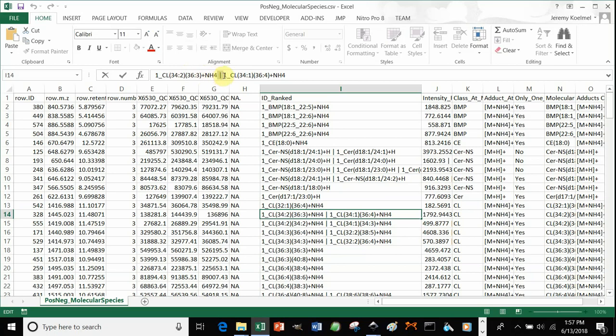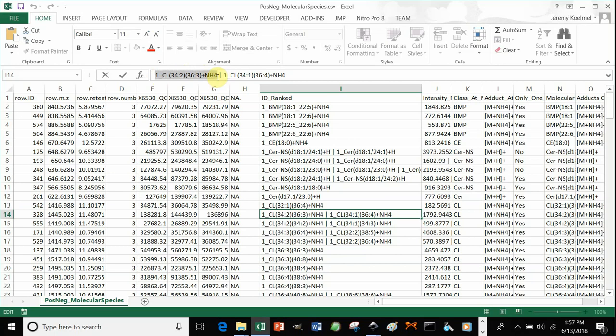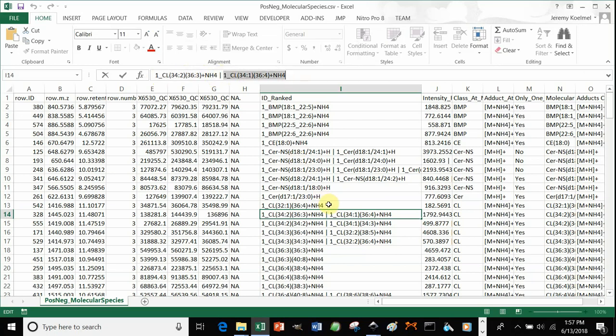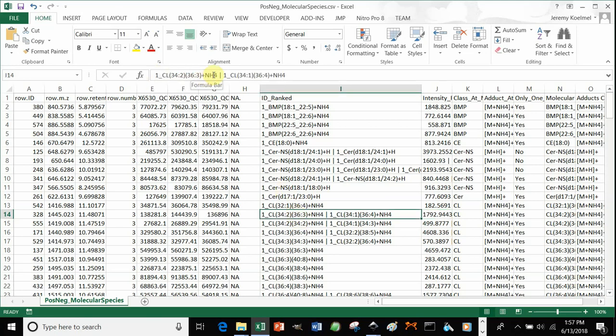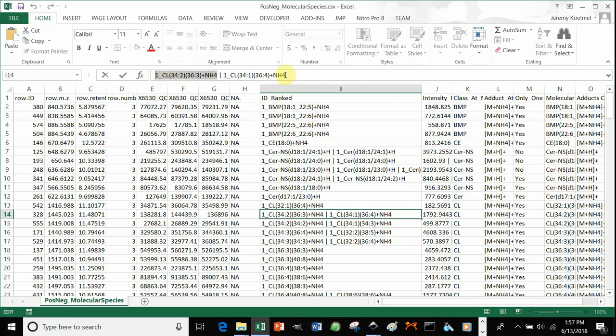You can see that there's a pipe here. A pipe separates that you identified two different cardiolipins under the same feature. They're ranked by the sum of signal intensity. So if we click here, we can see that there was a two-fold increase in the first hit for cardiolipins. And so this cardiolipin is probably much more abundant and contributing more to the signal than this cardiolipin.